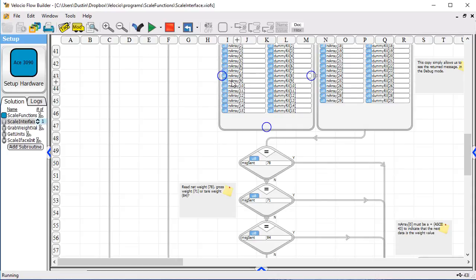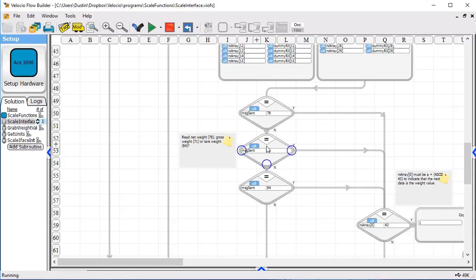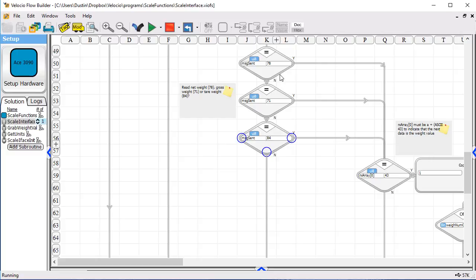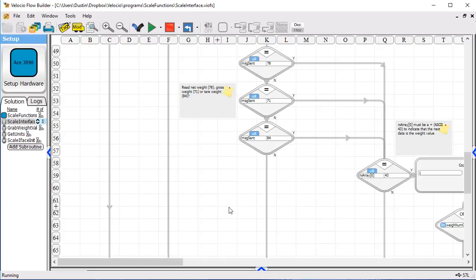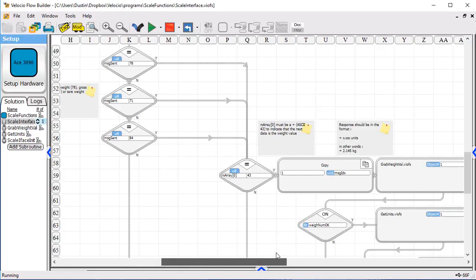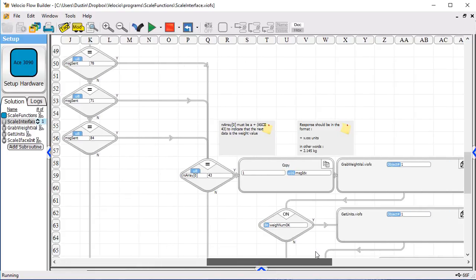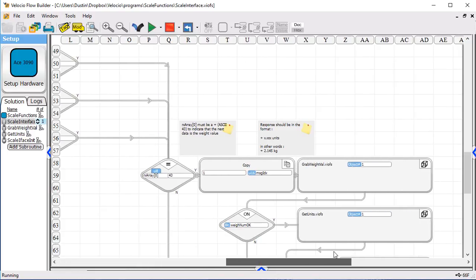And then, we've got the receive message. We check to see what type of message did we send. If it's one that involves a scale reading, which the 78, the 71, and the 84 do, then we go over and we check to see whether the message is proper, and we decode the data.